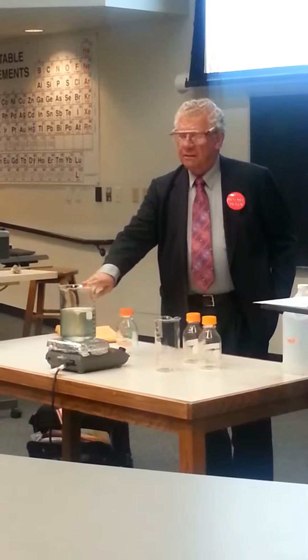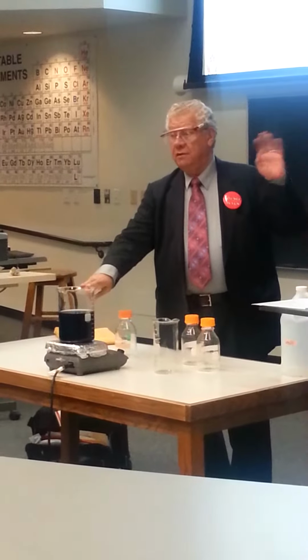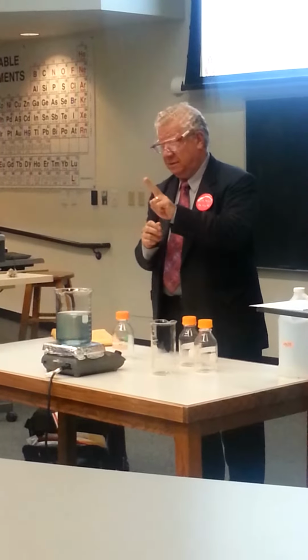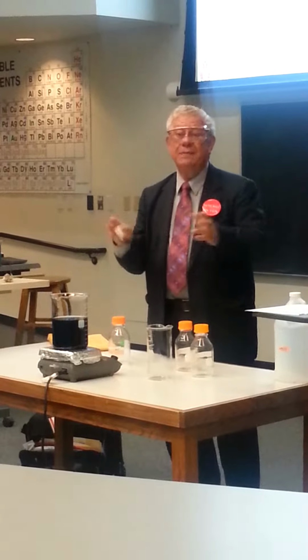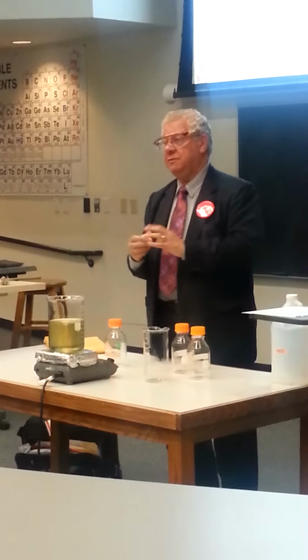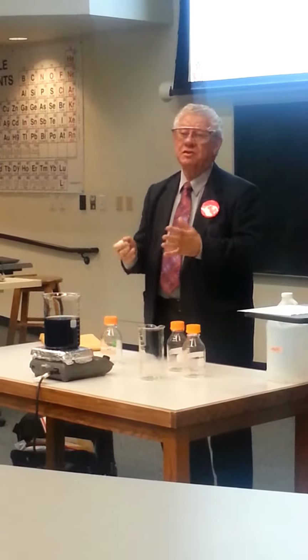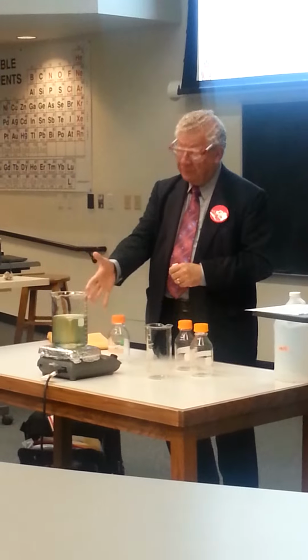This is called a chemical oscillating reaction. It's one of about 50 known such reactions, but this one is very special. It's special for two reasons. The first reason is that it was discovered by two high school teachers. It's named after them. It's called the Briggs-Rauscher chemical oscillating reaction. Briggs and Rauscher taught high school chemistry and physics in Northern California. And in 1973, they published a paper in the Journal of Chemical Education describing this beautiful, captivating behavior that we see right here.